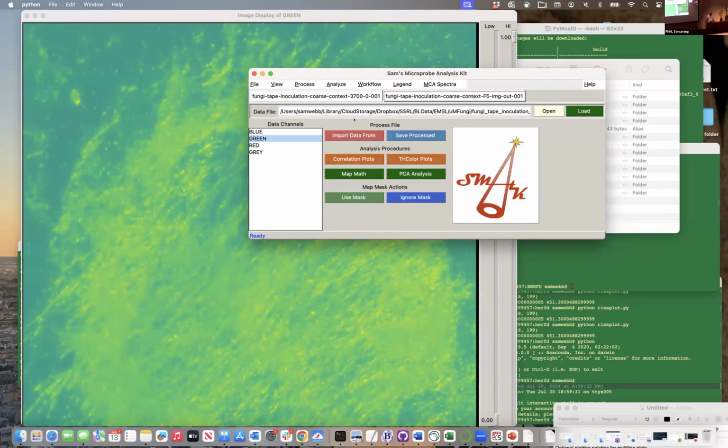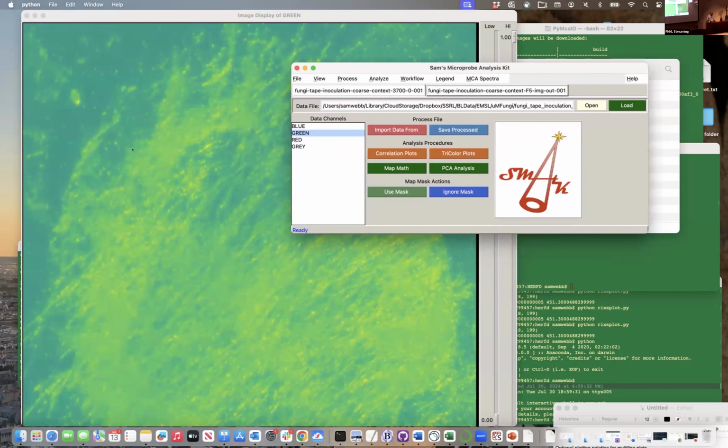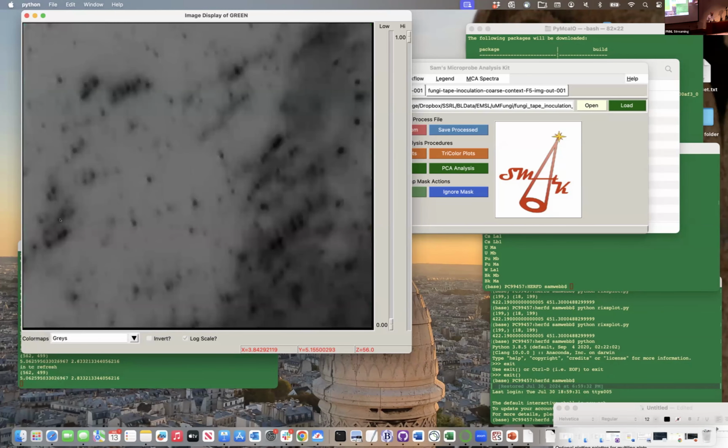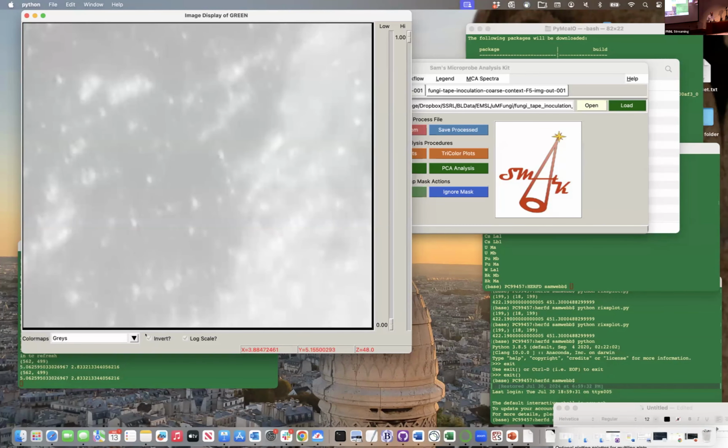Quite often, if you don't have a giant 35-inch monitor in front of your desk, you won't be able to see the entire image. But you may want to see the entire image. There are two tricks again for that. If you just want to change the color map to grayscale, so you can see how it looks in a photograph, you can do a quick zoom on one portion to get the color map selection screens on the bottom here. And we can go back up to a grayscale like that, and we can invert that to make it look the right way.